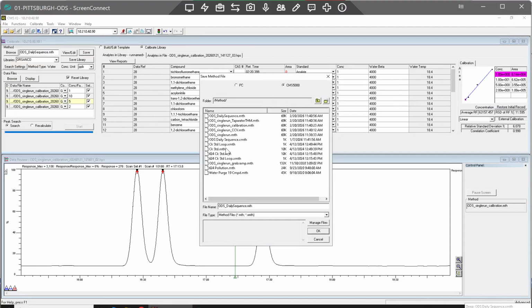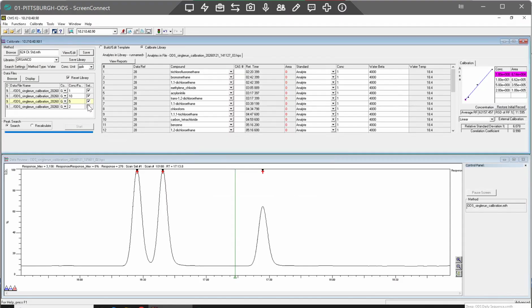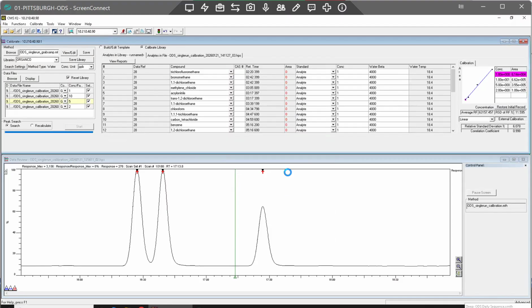And just double check. We have our check standard, which technically we can also do, since that just uses toluene, but then I guess we'll know if our retention time is the same. I don't know if that matters, but let's see this single run grab. Do it for that one too. Okay. So I think that's it. Let me read the recipe one more time.